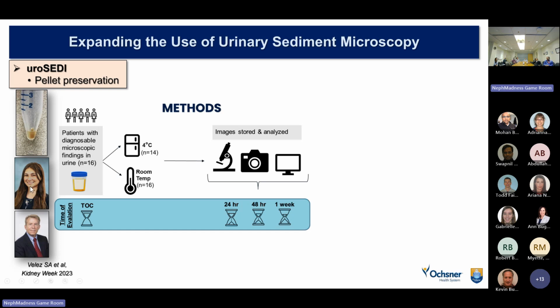This is my daughter, Serenella. She presented this work at Kidney Week last year. And essentially, we collected urine, and then we looked at the urine, took images, and we left samples at room temperature or at 4 degrees, and we look at urine and acquire images 1 day, 2 days, and 7 days later.